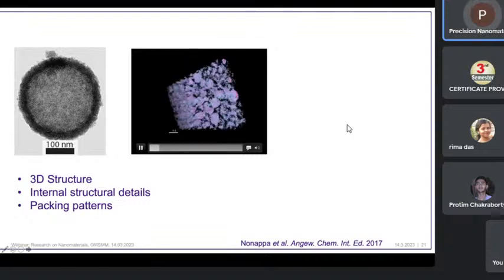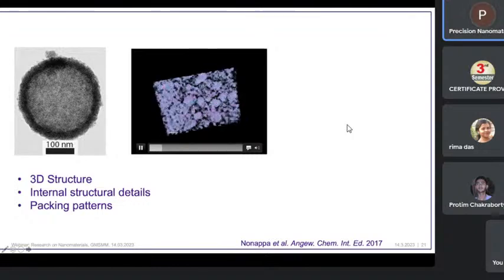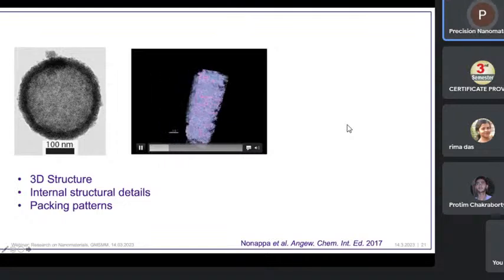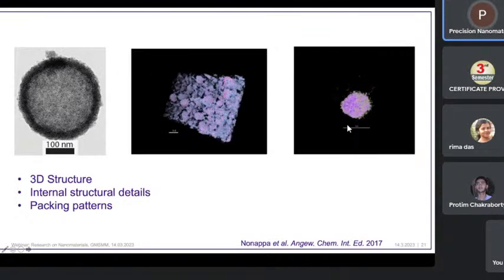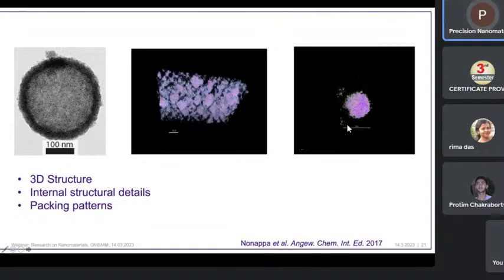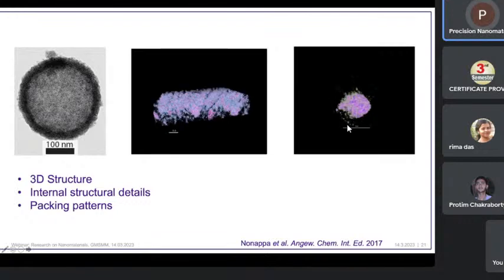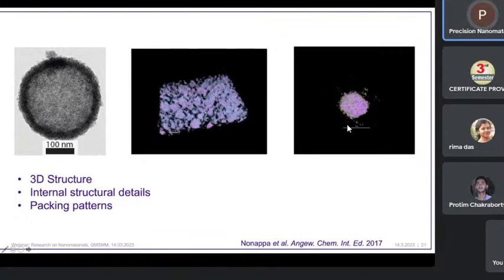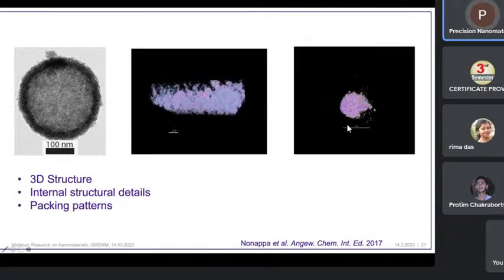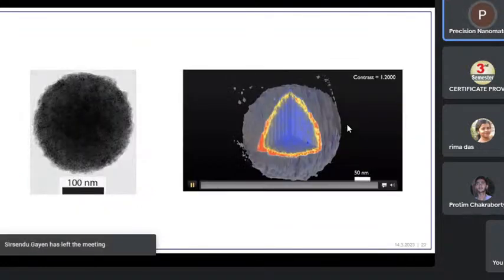individual nanoparticles are arranged. From these, we can collect similarly looking or size and shape nanoparticles, which is called a subtomogram, and we can say how a single nanoparticle looks like. Such complex structures, we are able to identify the ways and position of the structures.